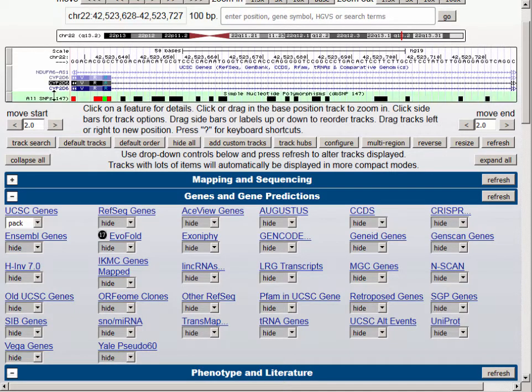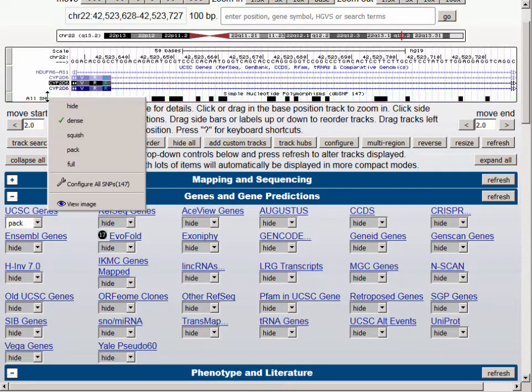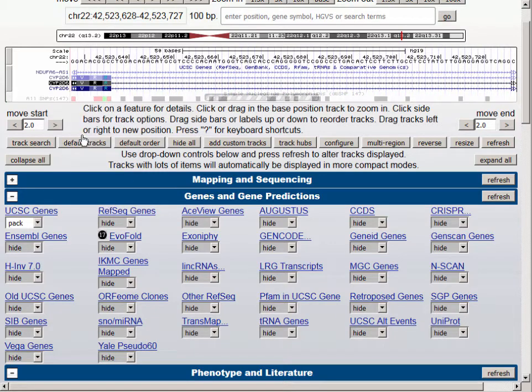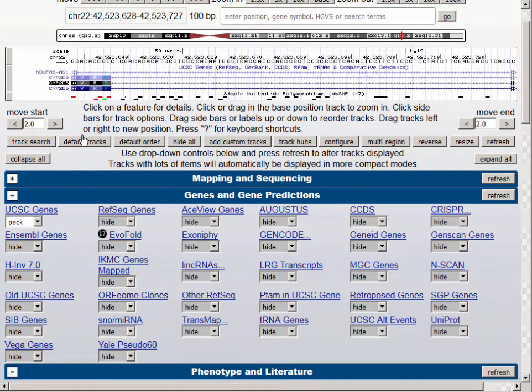The final visibility option on the SNP track is Squish mode, which, as it did for the Genes track, gives us a display that uses up a very small amount of space on the browser.